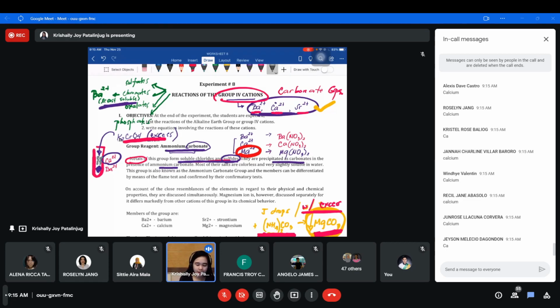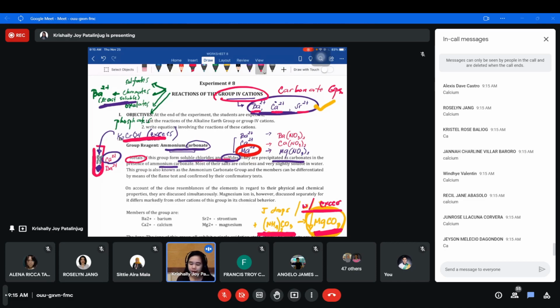Okay? Kapag naman oxalate, among the list of cations, it is the calcium naman. Calcium ion that is considered least soluble, or let's say less soluble. Okay? Kumbaga, kahit excess pa ng oxalate ion, nireact mo kay calcium test solution, calcium oxalate will remain insoluble. Okay? So later, that will be applied, no? Yang knowledge that will be applied later on sa proceeding procedures.